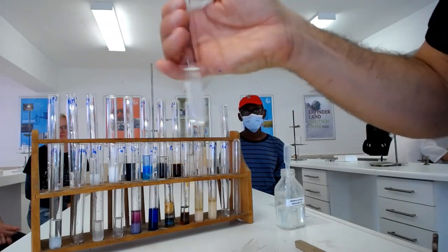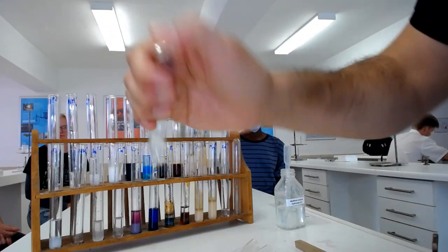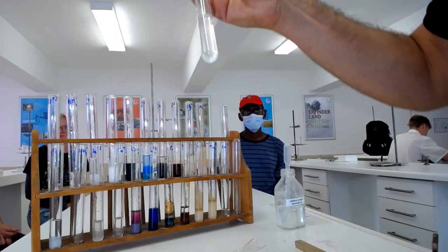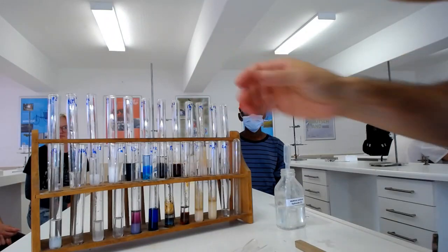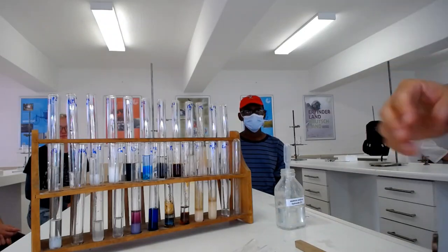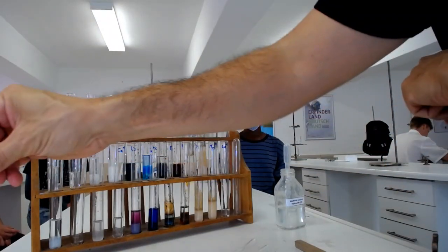Usually you'll have a rubber stopper to do that. Don't use your finger. These are 2 molar concentrations, so it will burn you. It will burn you. It's fine.